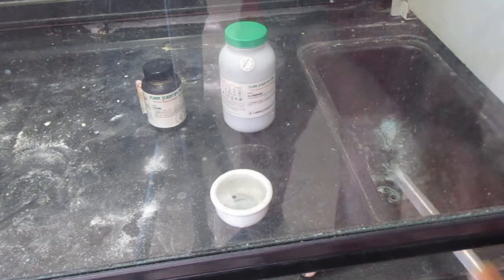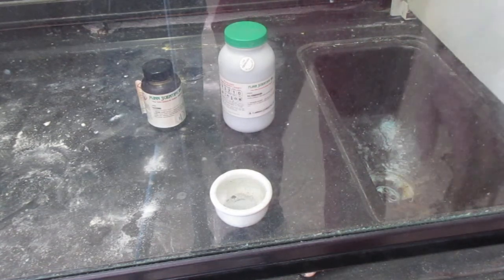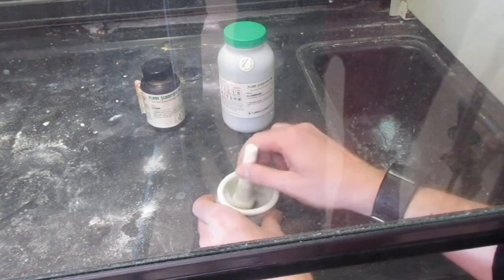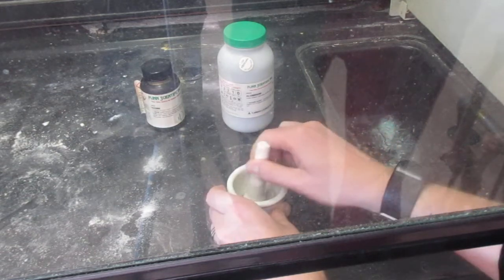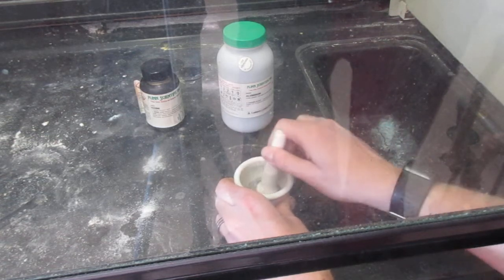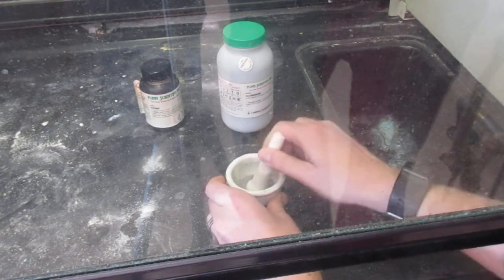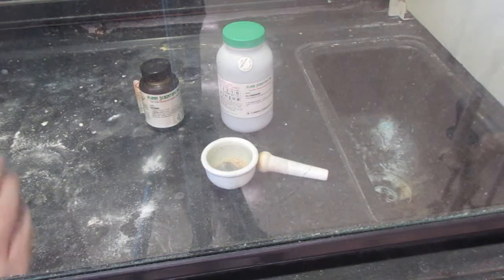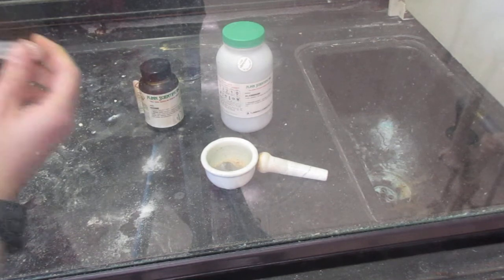I'm then going to take this out and mix it. I'm in a fume hood. I tested this two other times first, and this is not something you want to be doing on your own. Then I'm going to add just one drop of warm water using a hot plate I have off camera.